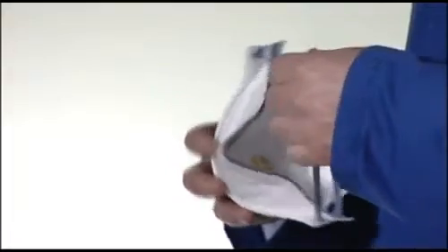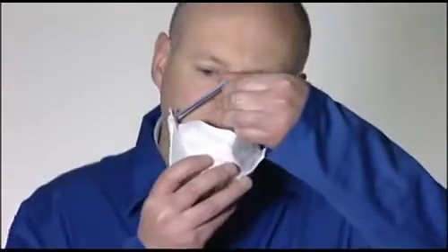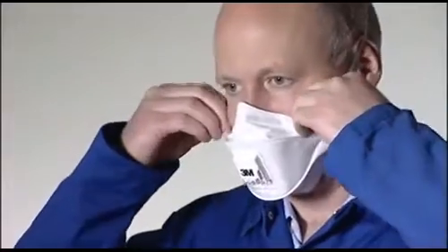Cup the respirator in one hand with the open side towards your face. Take both straps in your other hand. Hold the respirator under your chin with the nose piece facing upwards and pull the straps over your head. Locate the upper strap across the crown of the head and the lower strap below your ears. The straps must not be twisted.